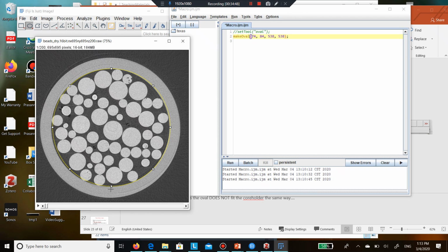Okay? And then you can move. Here you have enough padding on the side. Your region of interest is inside enough that you can then move the bottom images, you can shift them, but you have to progressively change, you have to graduate through all of the slices. But you can do that calculation. That has to be done constantly for these type of things.